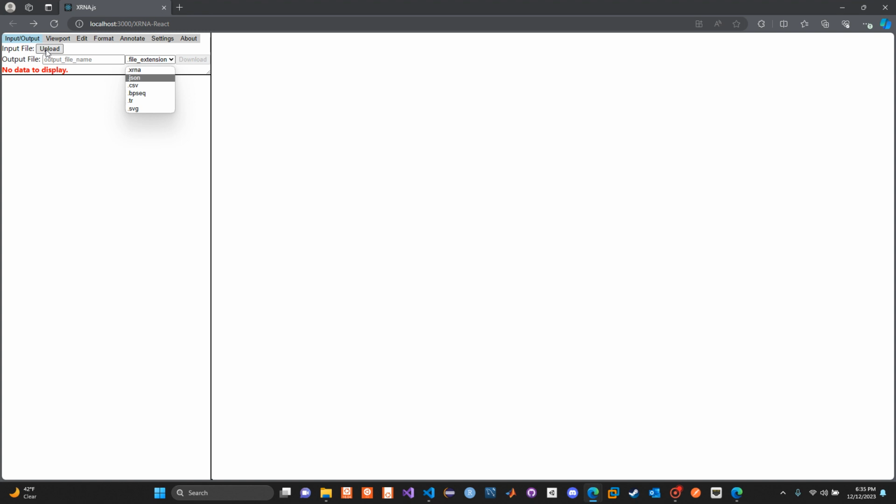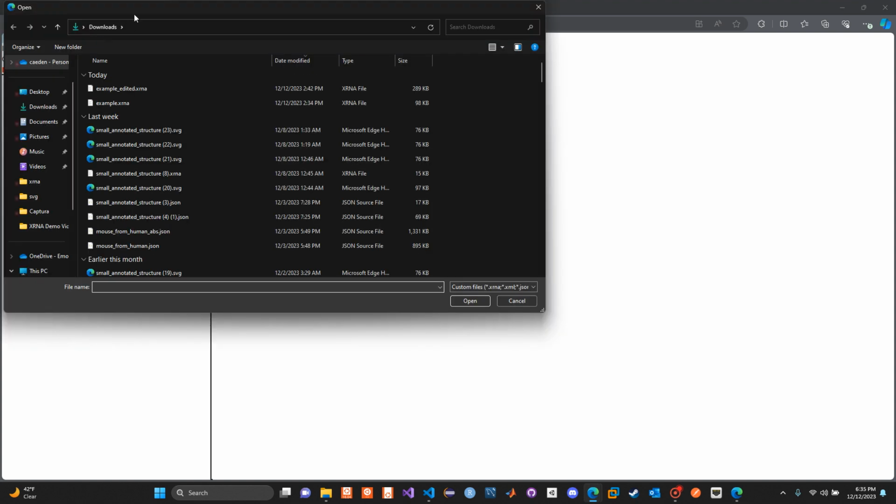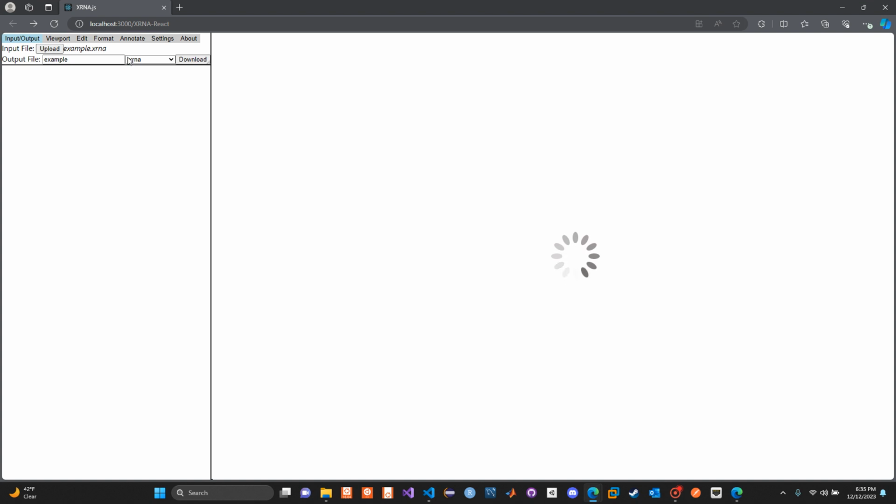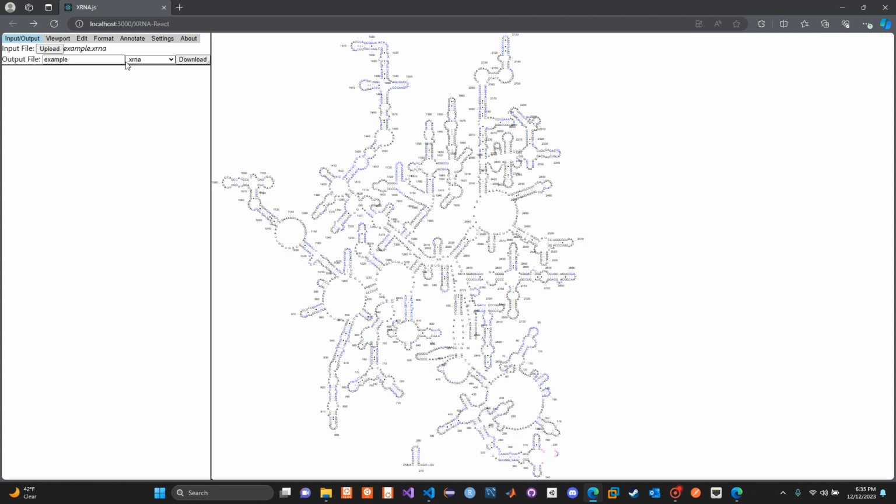Here I'll show you what this behavior does by default, and simply note that these two fields will change. So these become auto-populated. The idea of this is to allow the user to be able to make changes to the data in this scene and then download it in order to have a copy of their modified files without having to re-specify the name and the extension. Of course, this is a JavaScript app, so it's not capable of overwriting a file directly on your file system. If you want to replace a file, say you're trying to edit some of the values in that file, you're going to have to rename the files yourselves.